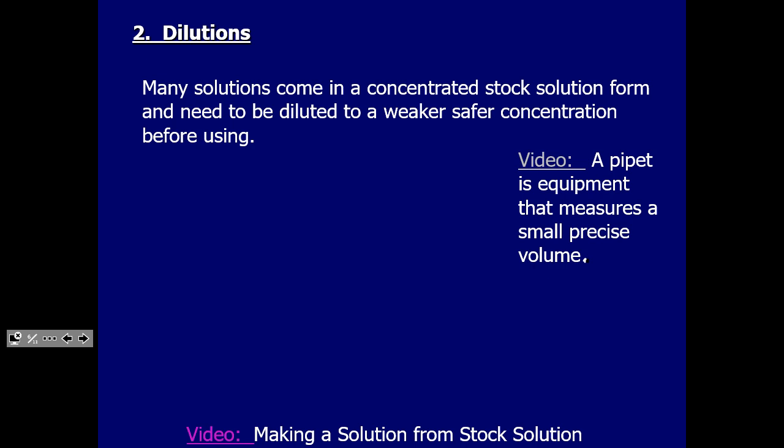And then a few years later, we got some instructions from the safety people saying, don't do that lab anymore. 6 molar is too strong. If I get 12 molar on my skin, does it melt my skin? No, it doesn't. Hydrochloric acid, it's strong, but it doesn't react that fast. Concentrated nitric acid will burn your skin. I have been burnt on my hands just a little bit because I noticed it with concentrated nitric acid. It reacts very quickly with the skin.